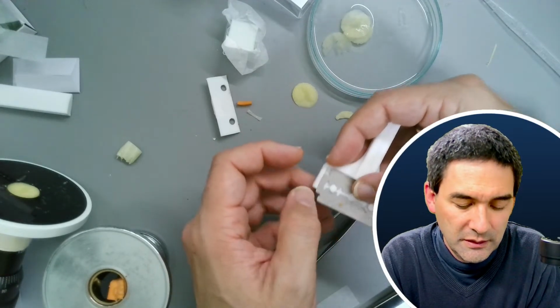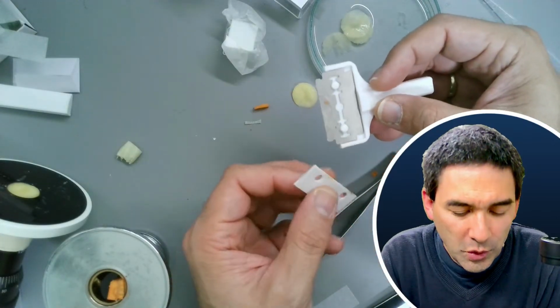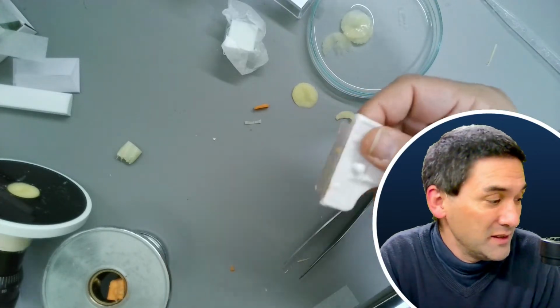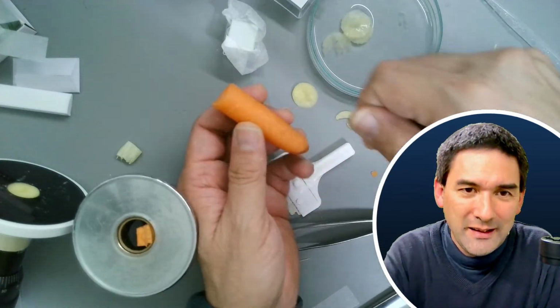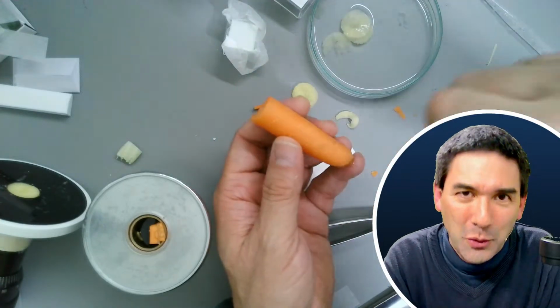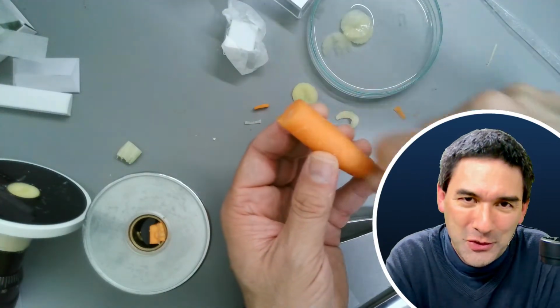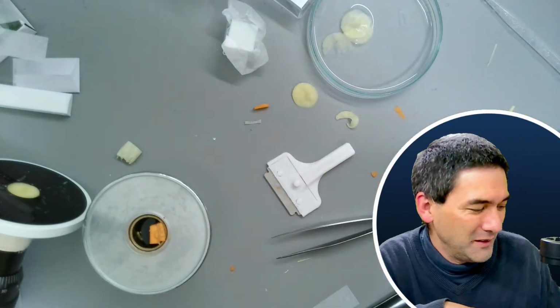But another thing that I have tried and which also worked is I've used disposable razors, instead of using a microtome. I just took the specimen and simply shaved off with the razor. This also worked. You also need a little bit of patience, and the pieces that you get are very small, but you can try to do that. Take a disposable razor and try to shave off some of the things here.